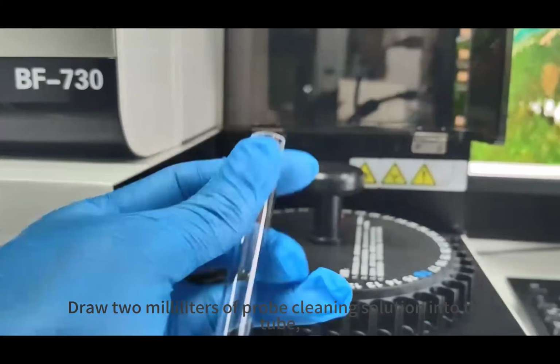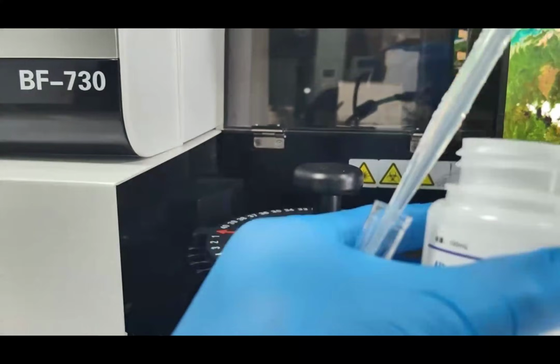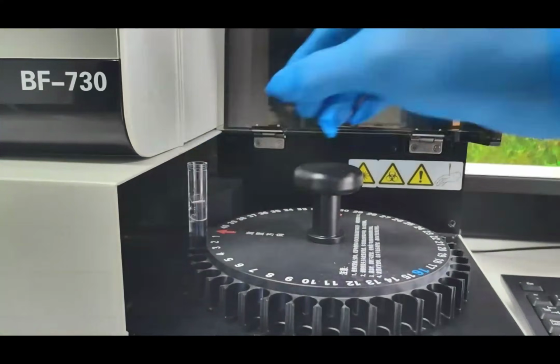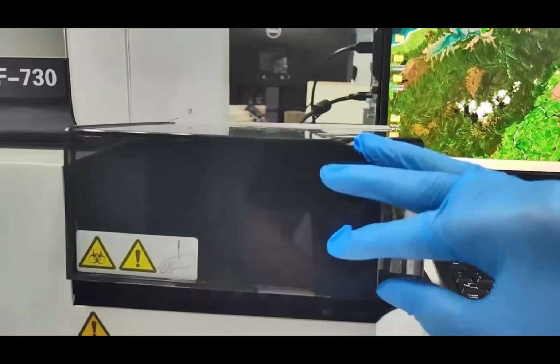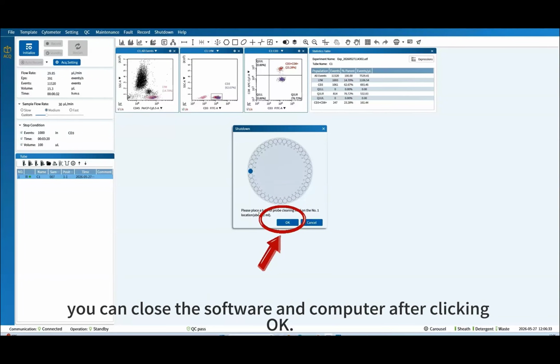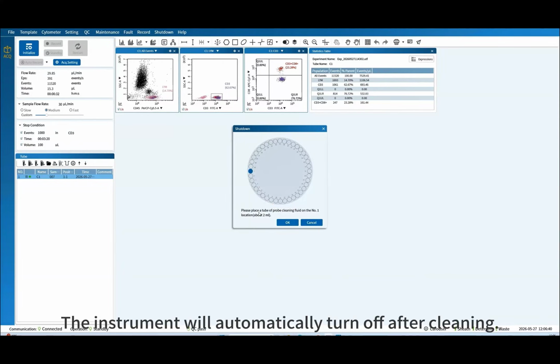Draw 2 milliliters of probe cleaning solution into the tube and put it in the first position of the plate. The entire shutdown and cleaning process takes about 25 minutes. It takes a long time, so after adding the probe cleaner, you can close the software and computer after clicking OK. Don't wait for the instrument to be clean. The instrument will automatically turn off after cleaning.